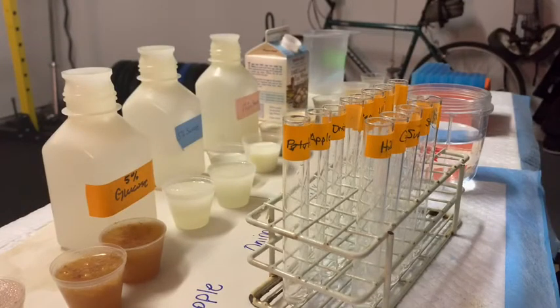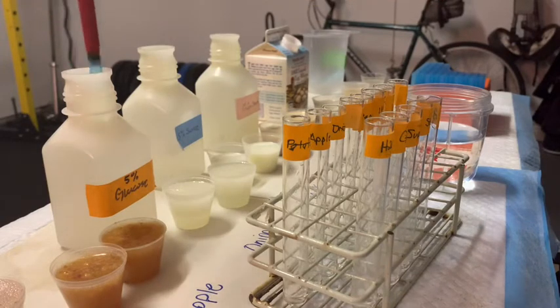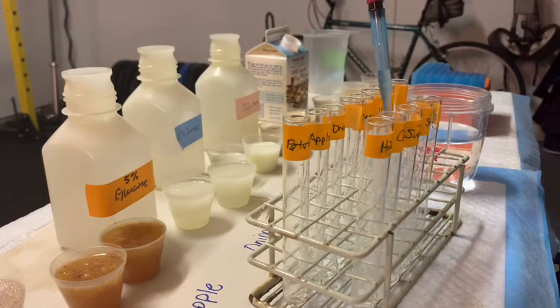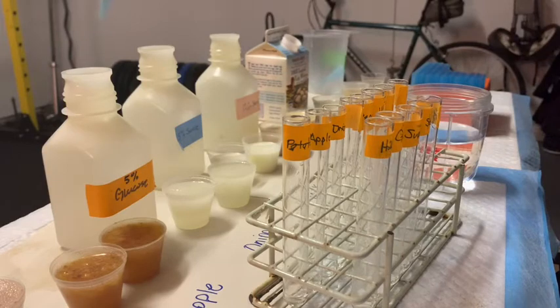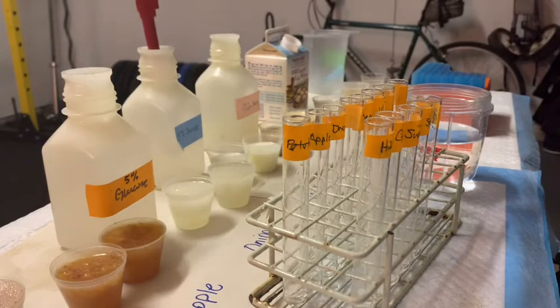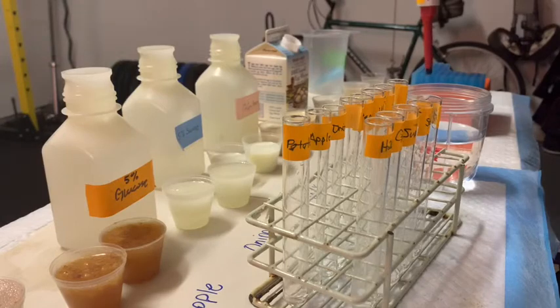Let's start off by adding our positive controls. I'm going to take one mil of glucose, put it into the tube labeled glucose, eject my tip, get a new one, go to the next positive control — which is going to be sucrose — one mil of that, put that into the tube, eject the tip, get a new one, and keep going down the line with the rest of our positive controls.